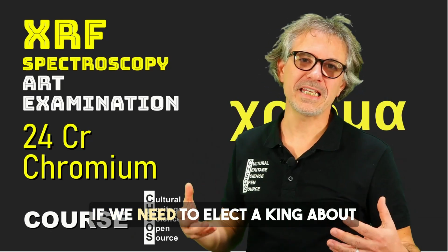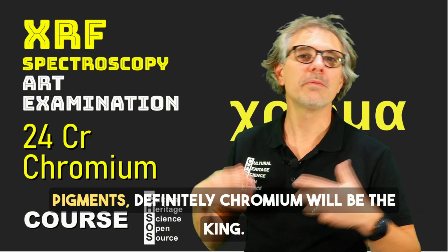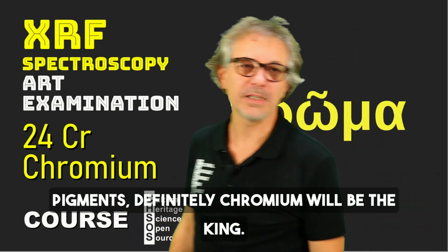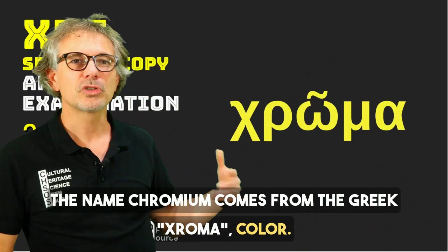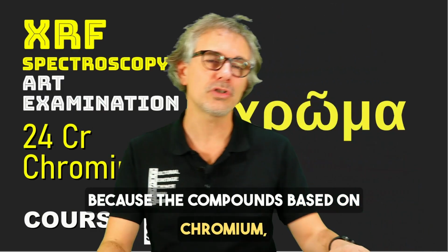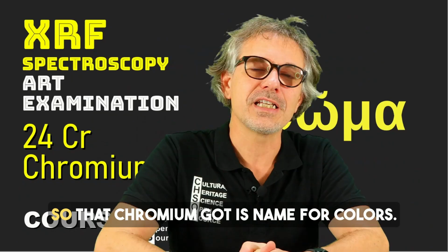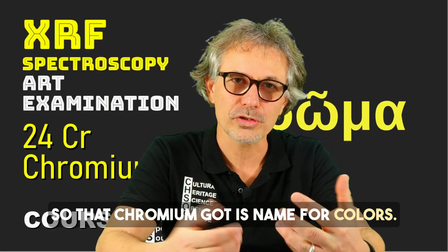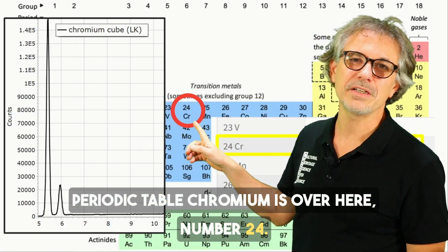If we need to elect a king about pigments, definitely chromium will be the king. The name chromium comes from the Greek chroma, color, because the compounds based on chromium have very strong, vivid colors, so chromium got its name for colors. Periodic table, chromium is over here, number 24.